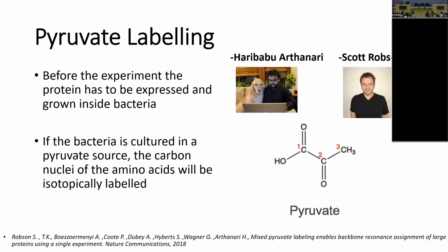And their idea was to assign the entire backbone for large proteins with single HNCA experiments without touching the C-beta chemical shifts.